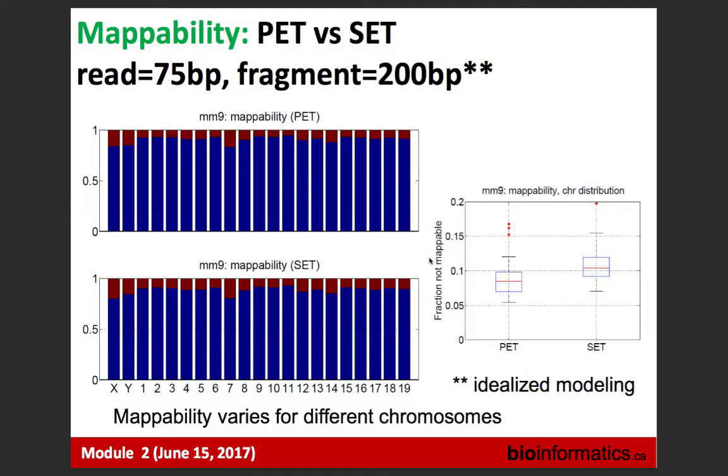Now, the longer, my understanding, and Martin can comment more, is that you have a limitation in your library construction with Illumina. You can't really go beyond 500 or 600 bases. It's very long, it doesn't bridge amplify. But I thought you said we only match the first 20. Right, that's correct. But now we are talking about read one, read two, the two pairs.